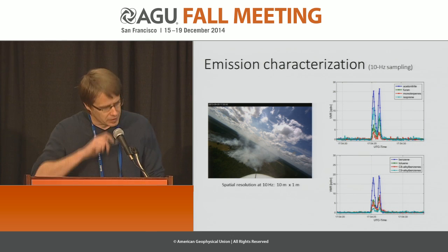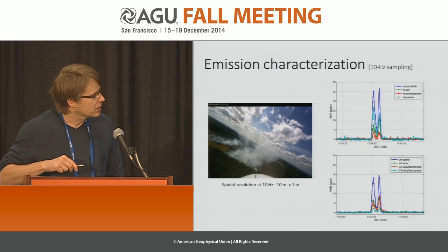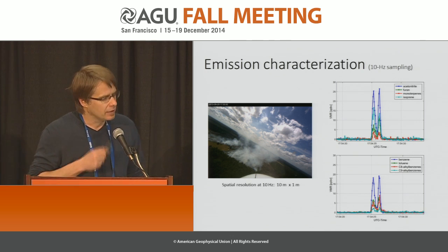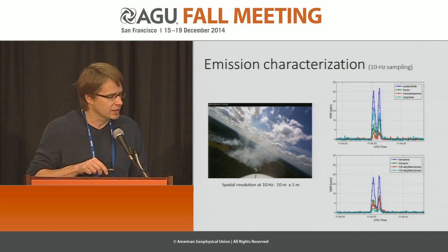So here you see a picture from the front camera, and we actually see it's a rather small fire, and it consists of two smaller fires. So we have two small plumes, and this picture shows you the analytical power of this new instrument. Note that from here to here this is 5 seconds.